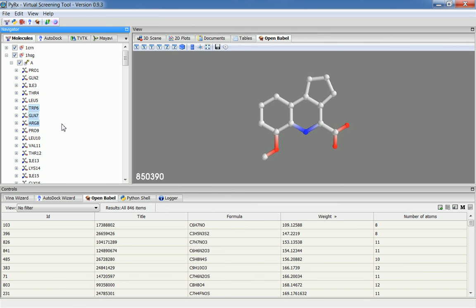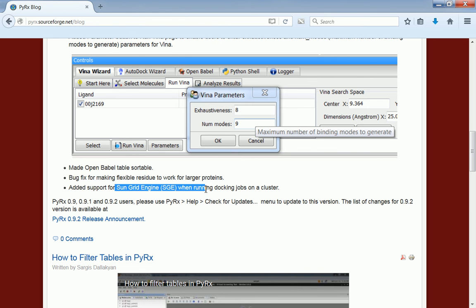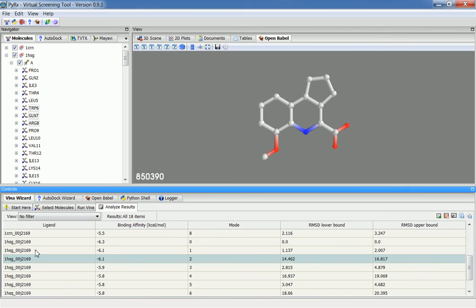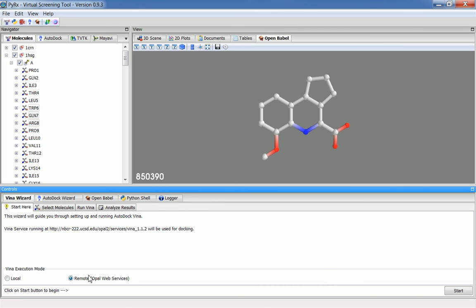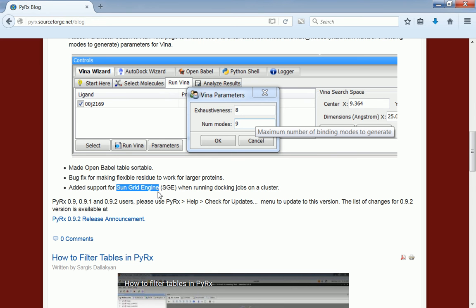That way you will be able to work with larger macromolecules. The next feature is an option to run docking using SunGrid engine. This is on Linux cluster. Besides the standard local and remote execution mode, there is an option to run on the cluster. Previously PyRx would support only Torque or PBS cluster job submission methods. Now with this new feature, users who are running PyRx on a cluster that uses SunGrid engine will be able to do so.